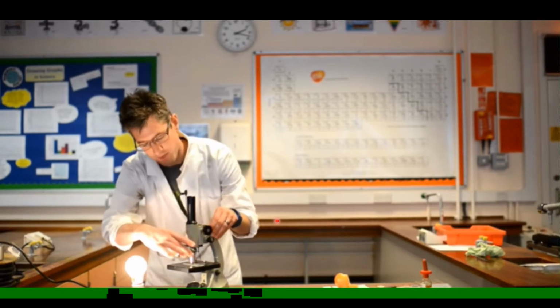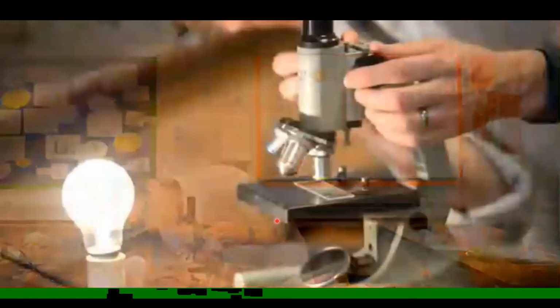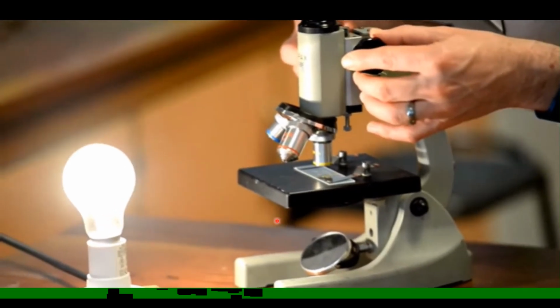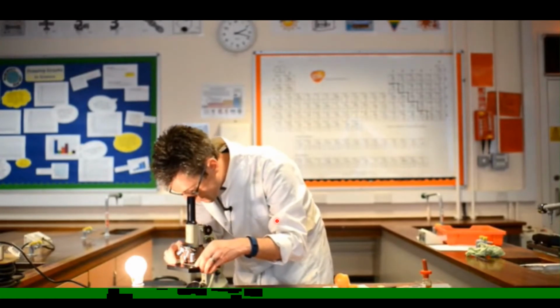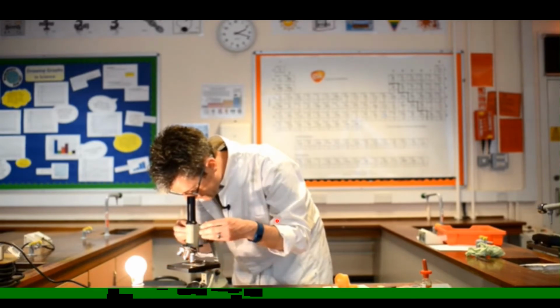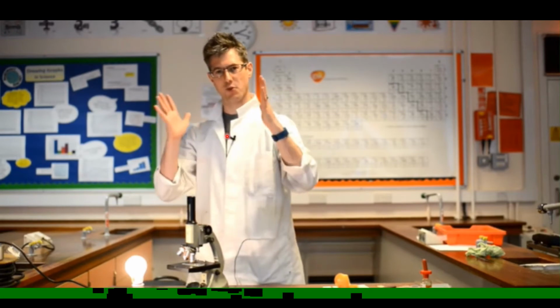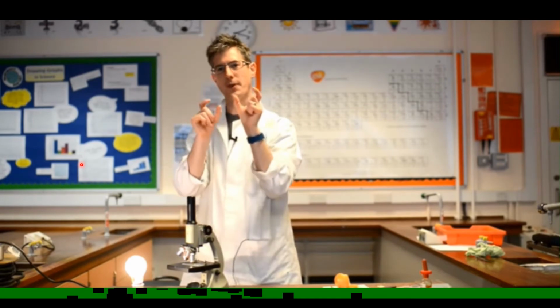So as the specimen, you can use live cells, that means microorganisms, or you can use plant materials, that means cross section of a leaf, and you can use an onion peel to observe the cells of a plant cell, and also you can use the cheek cells of you to observe the structure of the animal cells. So you can do this activity in the school laboratory to get a practical knowledge of using a compound microscope.